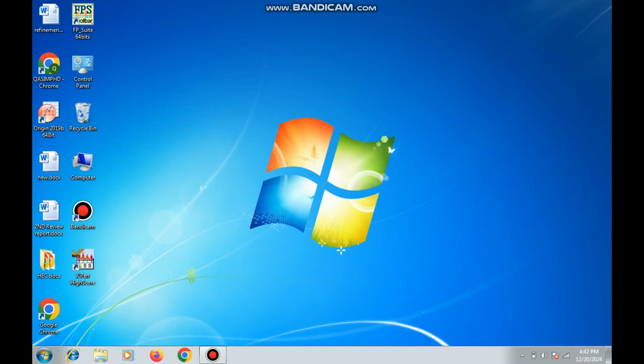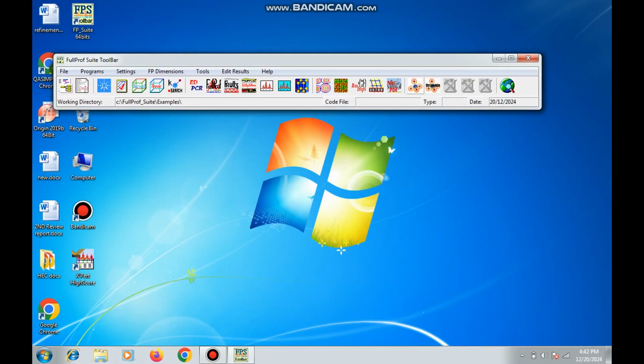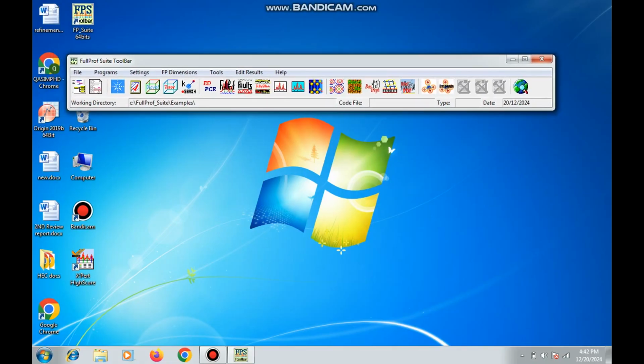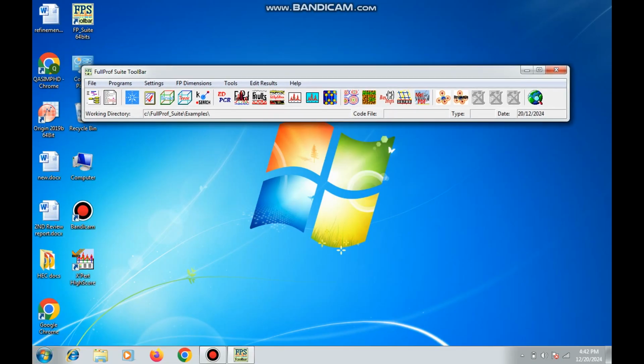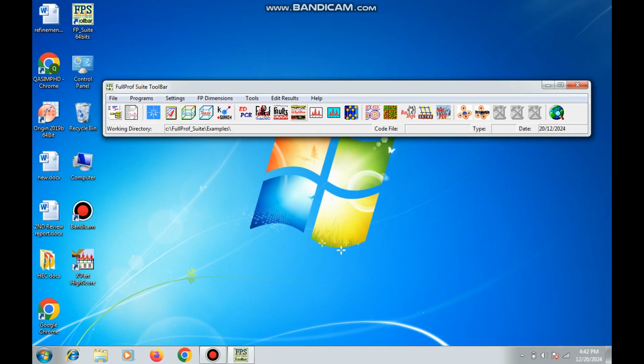For the Rietveld refinement, you have to first download and install the FullProf suite, which is a foolproof software for XRD Rietveld refinement of the data you have obtained. The main important files you need are the DAT file of your XRD data and the CIF file, which should be downloaded. I'm also telling you how to download that file.